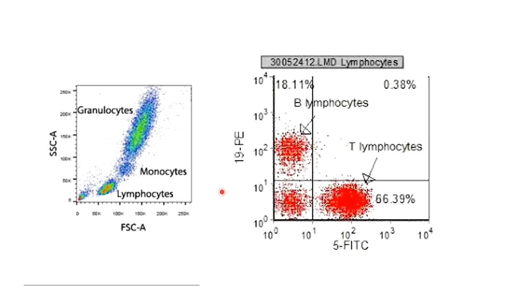One can ask me, sir, a flow cytometer can measure how many proteins? So I give the answer. You can measure multiple proteins at a time on a cell, but for that you need a system which can measure multiple fluorescences. Very simple. For 5 proteins you can measure, but you have to use 5 monoclonal antibodies which are tagged with 5 different fluorescent dyes.